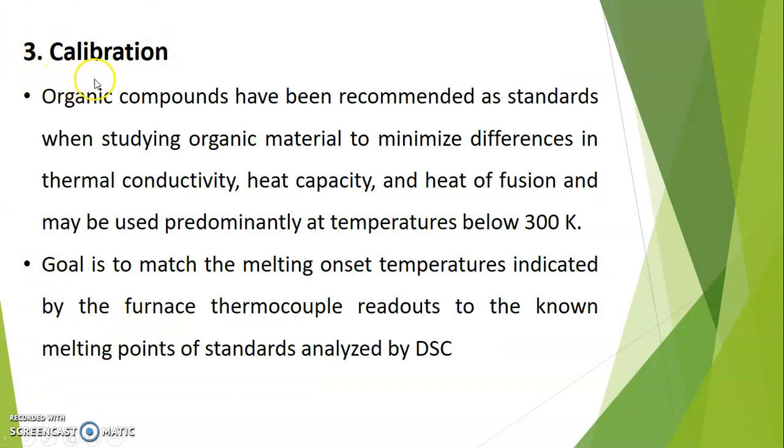The next point is calibration. Organic compounds have been recommended as a standard when studying organic material to minimize differences in thermal conductivity, heat capacity and heat of fusion, and they may be used predominantly at a temperature below 300 Kelvin.